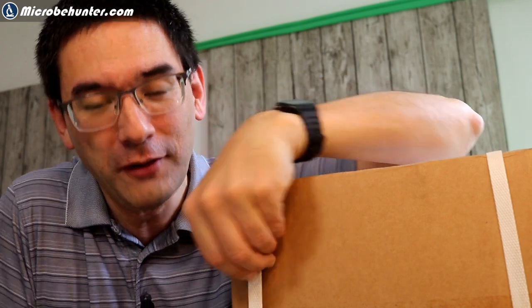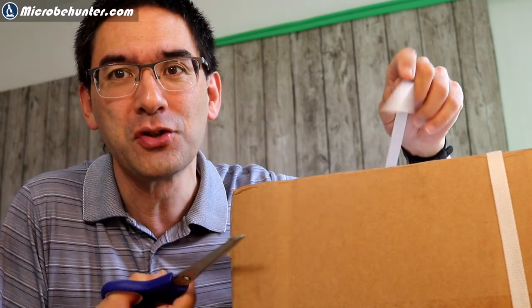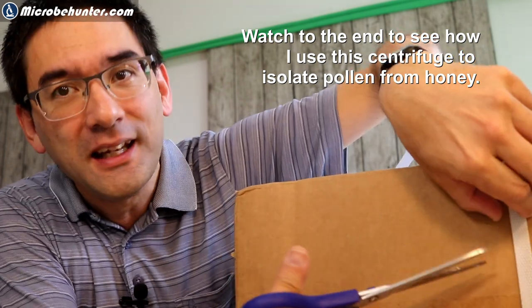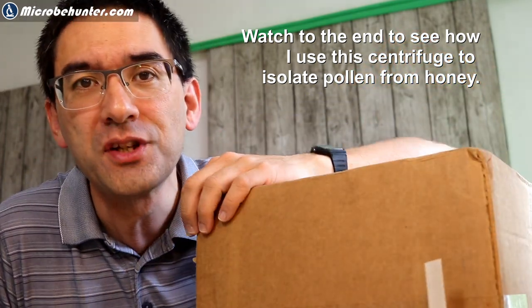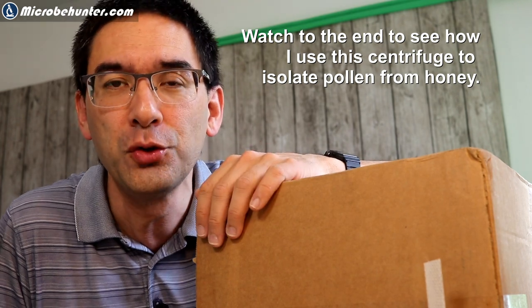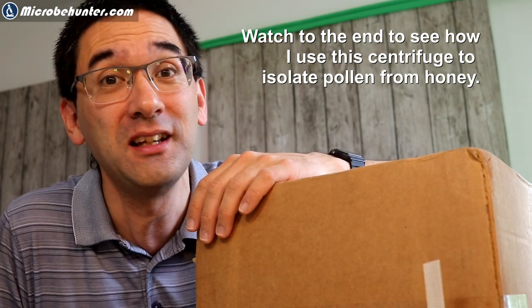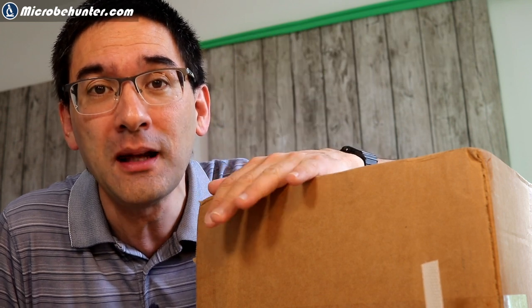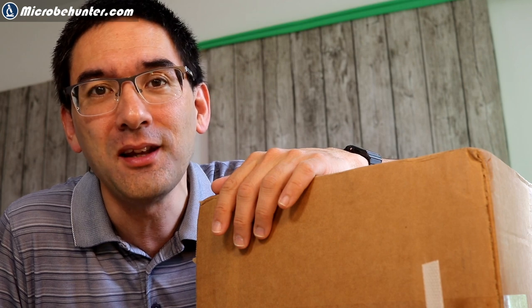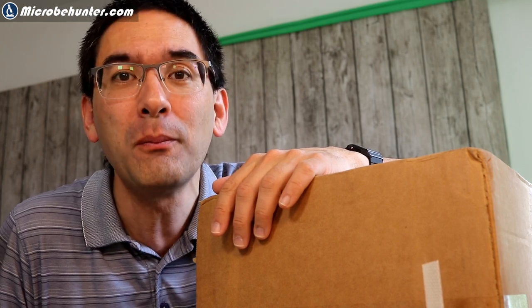Hi, Microbe Hunter here. What I've got here is not a microscope, but this is a centrifuge which I ordered. This was actually one of the cheapest centrifuges I could get. It's an electrical centrifuge — manual centrifuges were significantly more expensive. I'm going to unpack it now and show you what you can do with it. Obviously it's there to concentrate water microorganisms, so it's easier for them to be observed under the microscope.